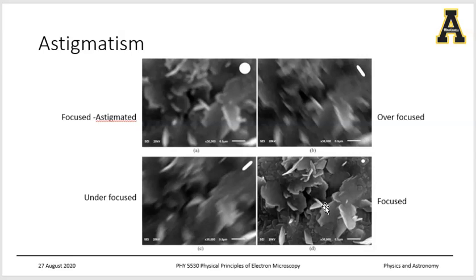Okay. All right. So now that we have figured out the different kinds of aberrations that are possible, and we have discussed the kind of electron guns we are using and the electromagnetic lenses we are using, the final thing we want to talk about is the quality of the probe beam that the specimen encounters, right?